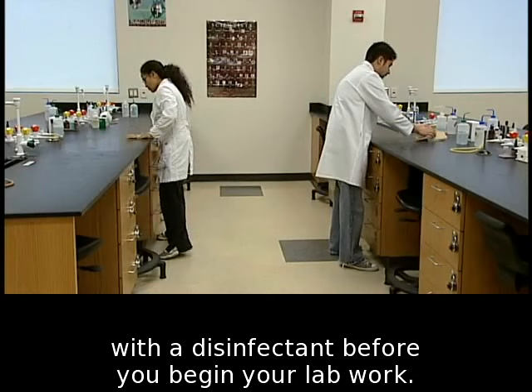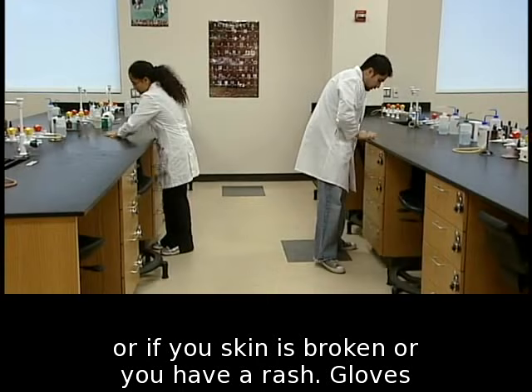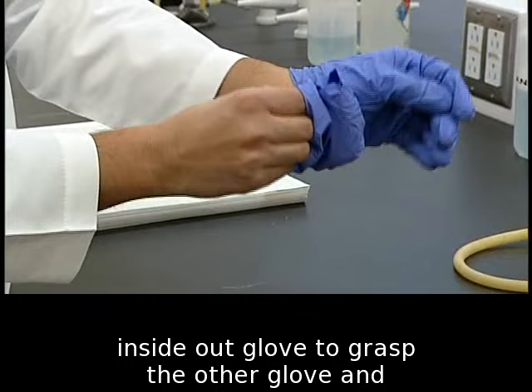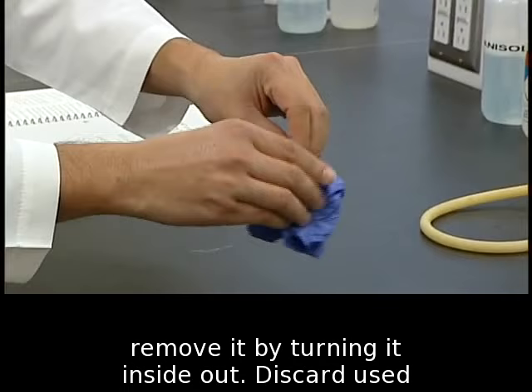Gloves may be required for a specific experiment, or if your skin is broken or you have a rash. Gloves should be used once. Remove one glove by grasping the wrist and turning the glove inside out. Use the inside-out glove to grasp the other glove and remove it by turning it inside out. Discard used gloves in the biohazard bag.